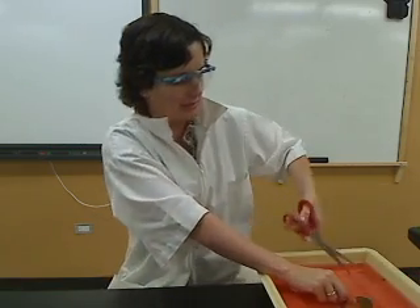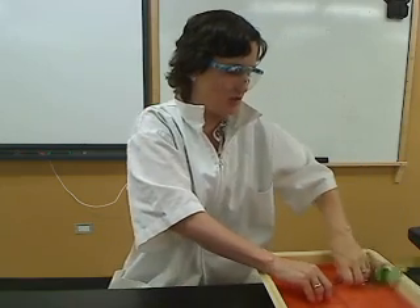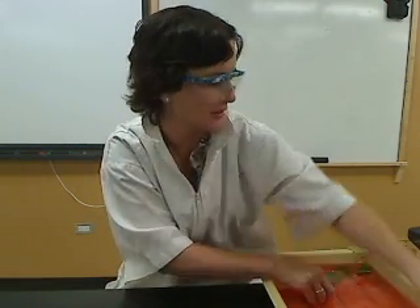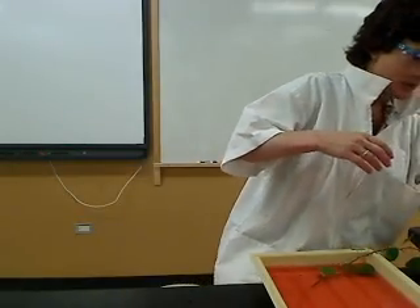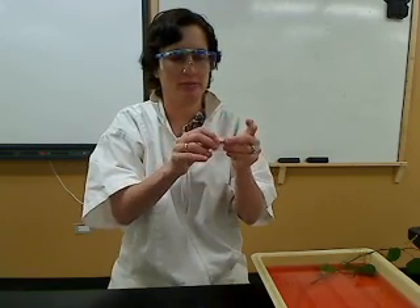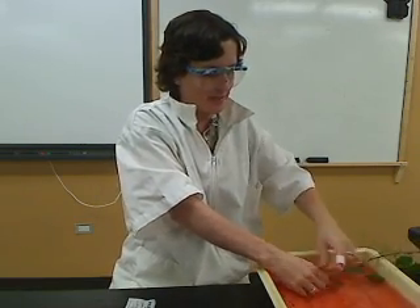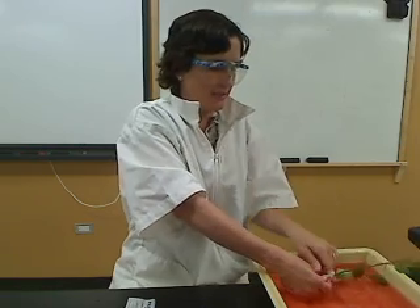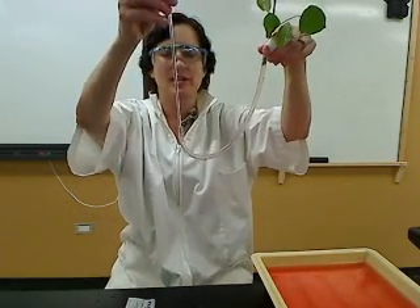I'm going to position this underwater inside the tubing. This time I'm going to have my daughter put her finger on the end so that the water doesn't run through. Just to be sure, I'm going to use some parafilm to secure the connection between the tubing and the plant itself. This is stretchy stuff, so underwater I'm wrapping it around and creating an airtight seal so that no air or water escapes. Then I lift this up, put my finger on it, and here we have the basic setup for the potometer.